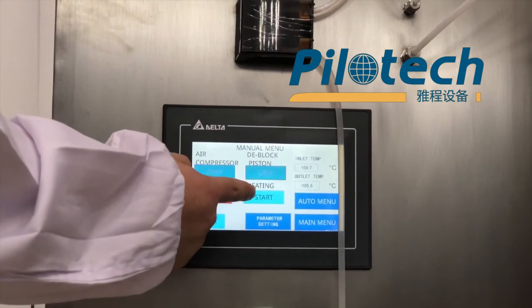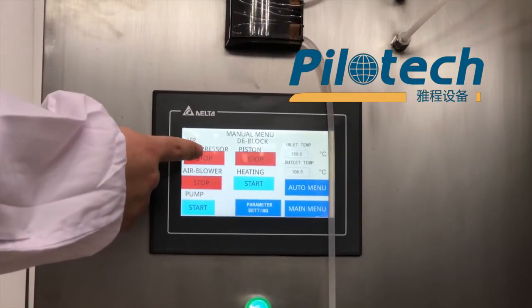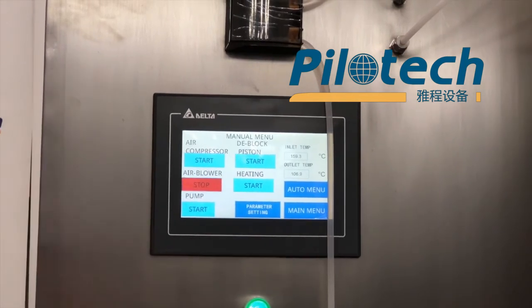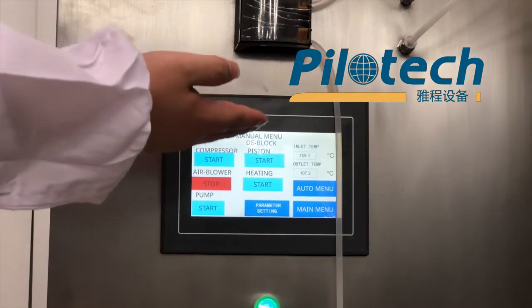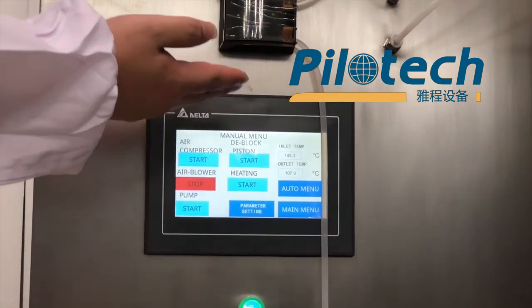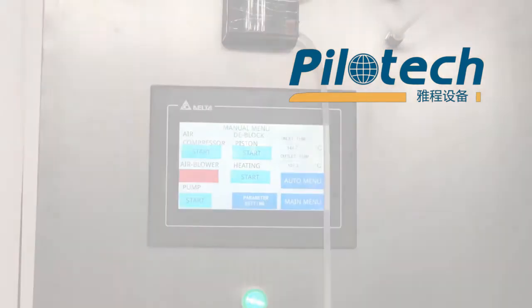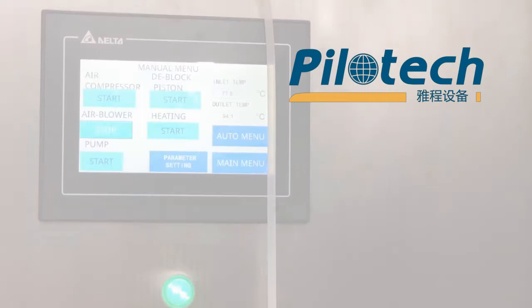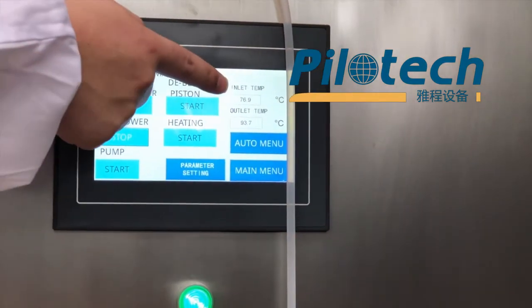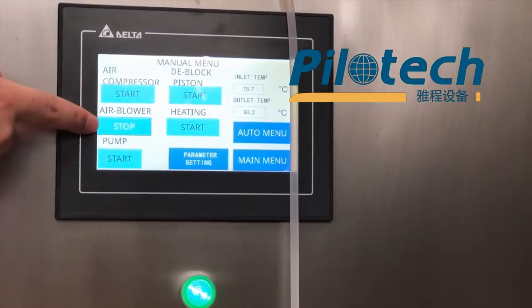Then stop heating. The next one is the air compressor. We need to stop the air blower after the inlet temperature is under 90 degrees. Now the inlet temperature is under 90 degrees, so we can stop the air blower.